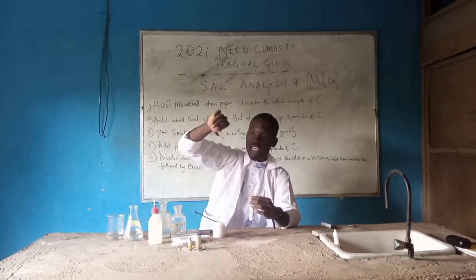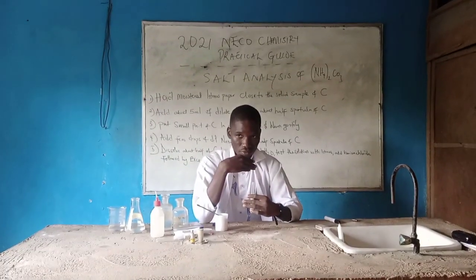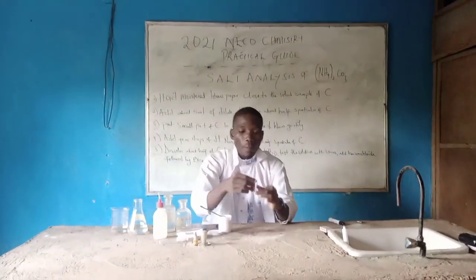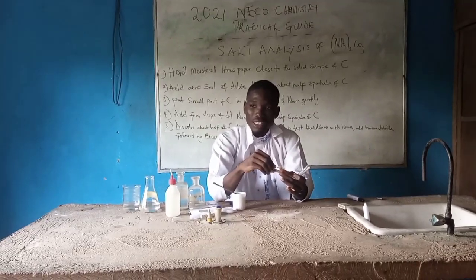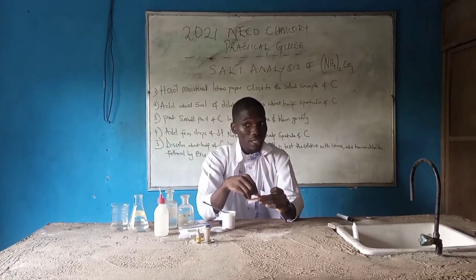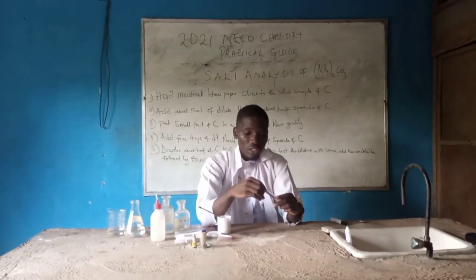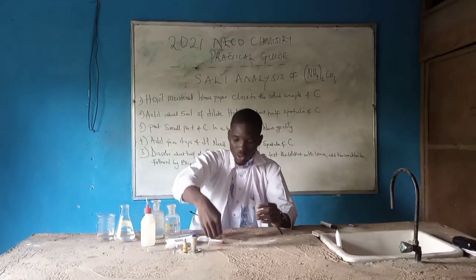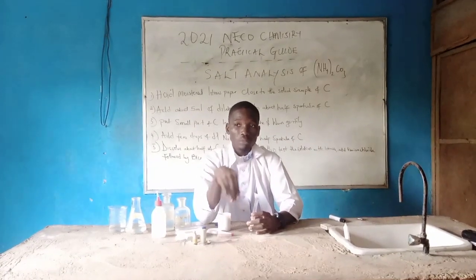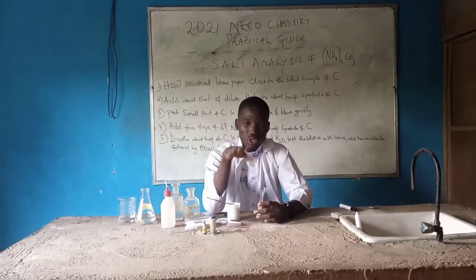As you can see, it has now turned blue. What I perceive is a choking or irritating smell. If I pick up a litmus paper to test sample C with dilute sodium hydroxide — what do we observe? A choking smell. On testing this particular gas on litmus paper, it is going to turn red litmus paper to blue. That is a good example of an alkaline. So after some minutes it changes from red to blue. The inference is: ammonium ion, NH₄⁺.